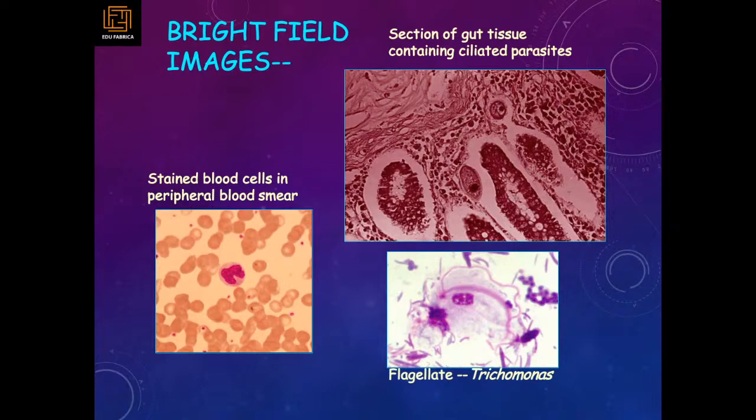which is somehow not so good for focusing on the things you're looking for. But on the other hand, to identify things at the primary level, it's okay. You can go ahead. But if you want to publish this data in a higher journal, most likely you have to go with the confocal microscope or higher end microscopy. But these are acceptable at the beginner's level.